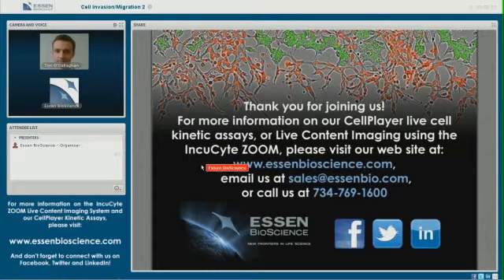So that's another way to take into account proliferation over the time course. These techniques can be performed and are compatible with this technology. So that's not a problem at all. You can either serum starve or run with full serum as you wish.